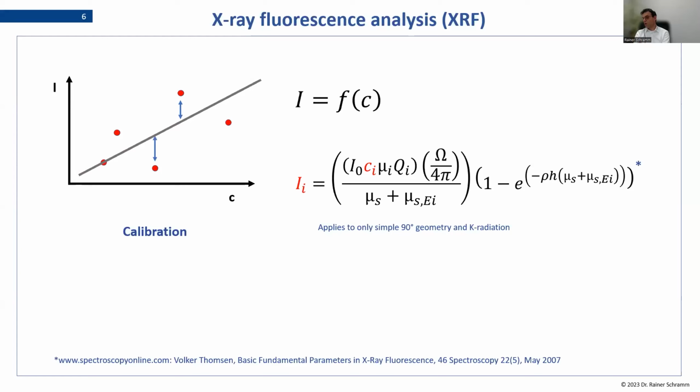Of course, this is also proportional to the time. But if you do standardless analysis, you need to make sure that all elements are excited. That is important, otherwise you will miss some elements. Then the basic rule that you have analyzed the complete sample is not valid, and your standardless software is not working correctly.